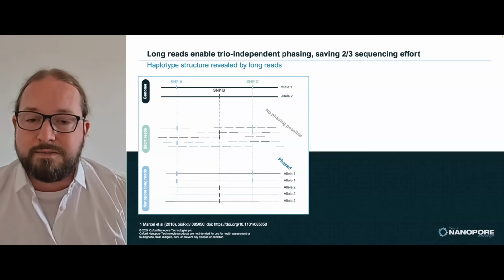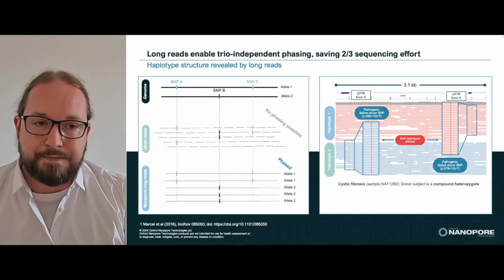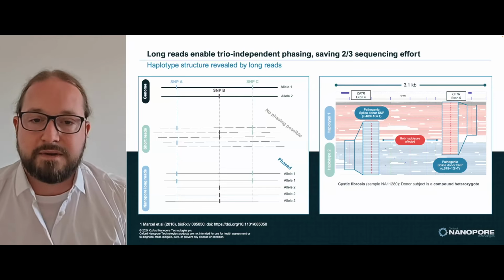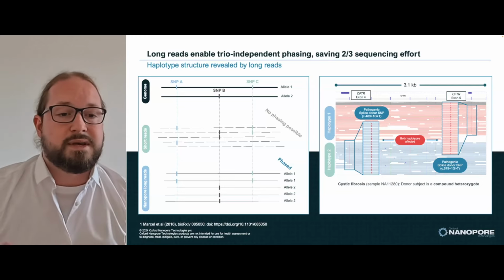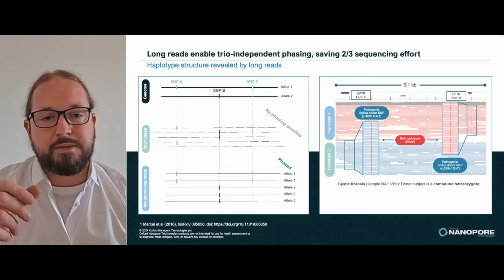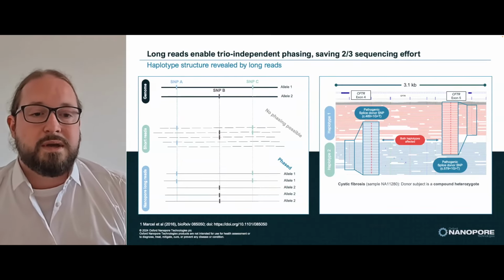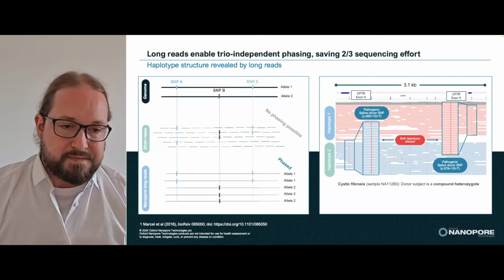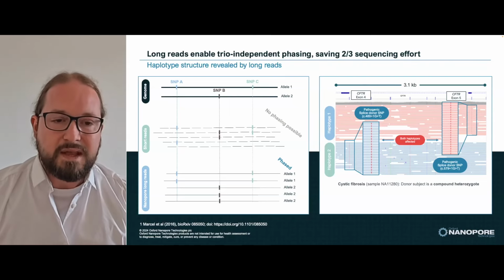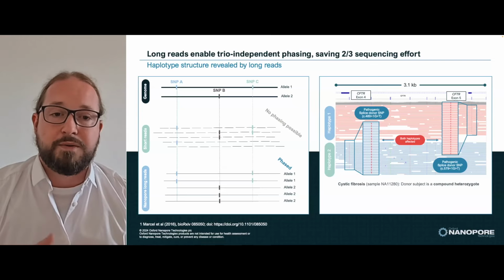So to illustrate why this is important, I'll give you a real example, an IGV screenshot from it. This is a region of the CFTR gene. You can see we did exactly what I just said. We teased the reads apart into two groups. The top one, the pinkish one, is haplotype 1, and the bottom one, the blue one, is haplotype 2. And these colored bars are our heterozygous variants. And here what's annotated is that there are two variants that are known to be pathogenic.